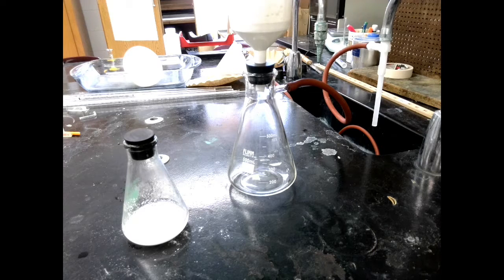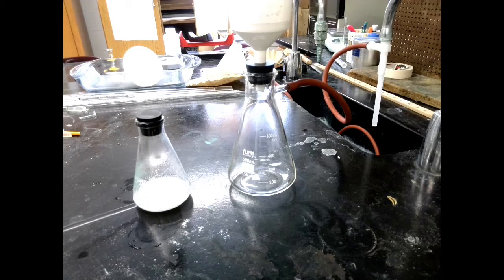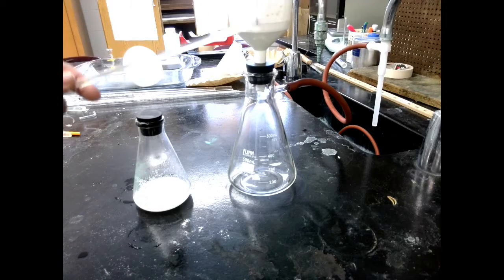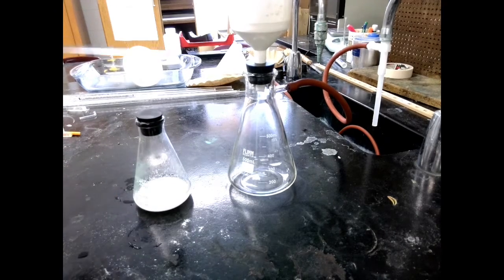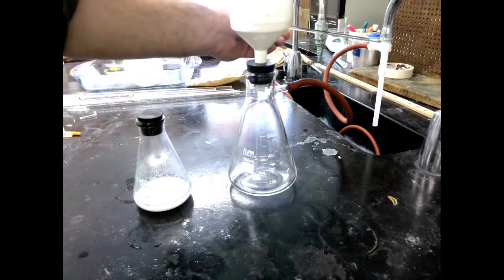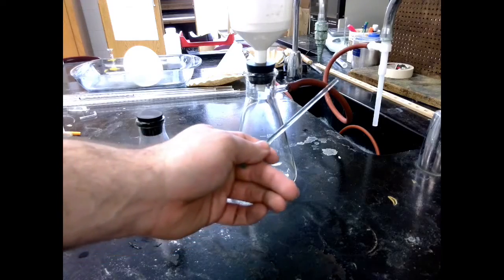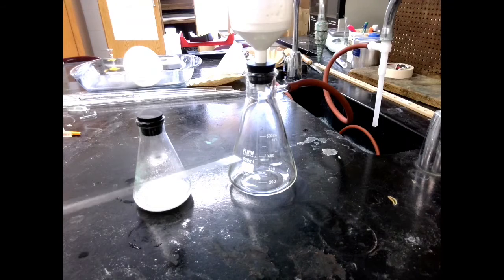So here I have my Erlenmeyer flask with my crude aspirin in it, in this little mixed solution. And I can see it's very cold, and I've got a lot of aspirin in here. In order to filter it, we're going to be using a Buchner funnel. So I've got the Buchner funnel set up here, along with a Buchner flask. I've got this set up to an aspirator, which when I turn on the water, it will allow a pressure to be pulled through here, creating a vacuum inside this flask, pulling all of my water through, and allowing me to dry out my aspirin.